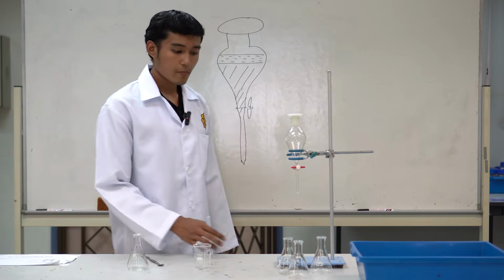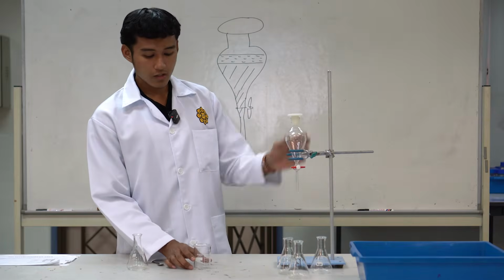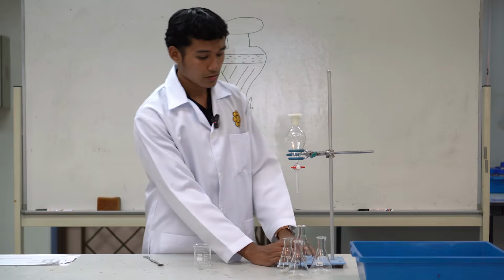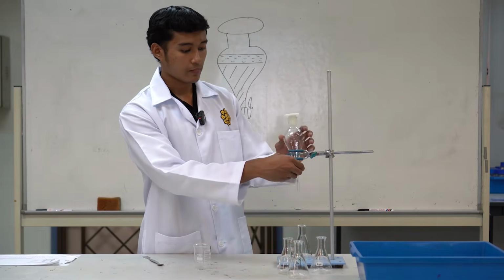Now, because the bottom layer is the mixture, I will take the mixture flask, place it under the separatory funnel, and open the stopcock.